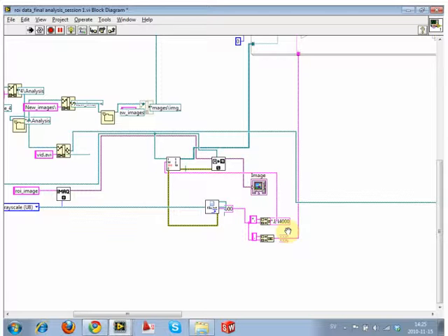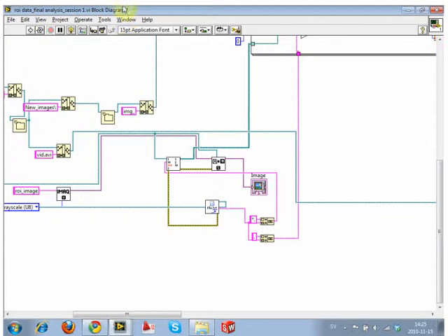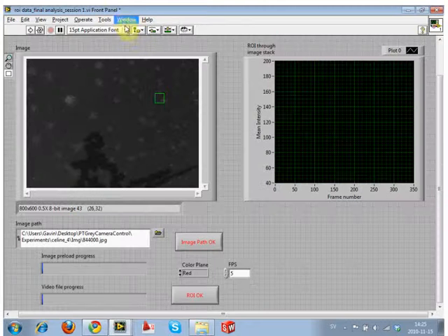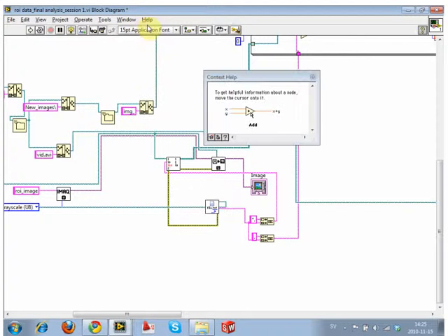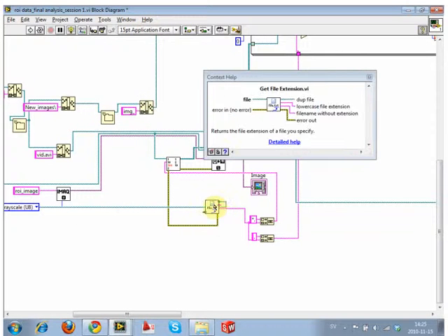So if we stop the VI, go to window. Nah, it's not show front panel. Show context help. Hover over this guy. Okay, do you see where we went wrong? We're supposed to wire in this one, and we hit this one. Oh, okay. So we hit the wrong switch. So we want to hit this one. Yes.